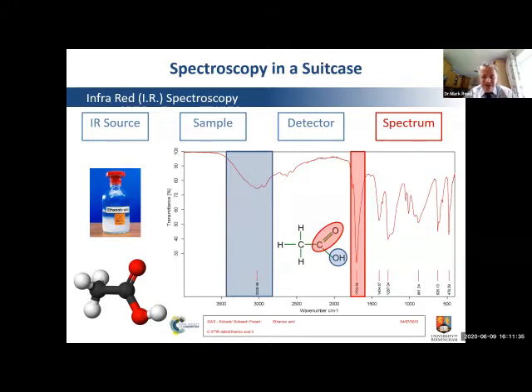So once the sample is on there, the infrared produced by the instrument passes through the sample and is then analysed by a detector to see how much has passed through. And our result, our infrared spectrum, is shown here. Essentially, it's a graph of results. Along the x-axis, we have the infrared region, the wavelength, although we use units of wave number, which is simply 1 over the wavelength. So that represents the infrared region.